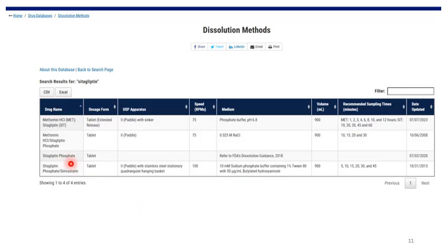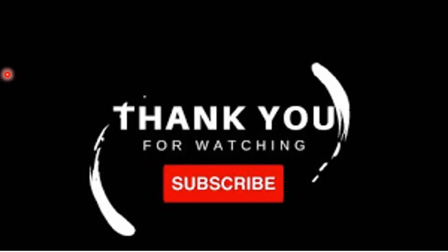Here, sitagliptin phosphate and simvastatin tablet: paddle with a stainless steel stationary basket type of holder, or the additional requirement, is given here. Then speed is given, media is given, volume is given, and the time points are given. In this way you can search the formulation of your interest. I hope this video will help you to use the database and understand the dissolution method.